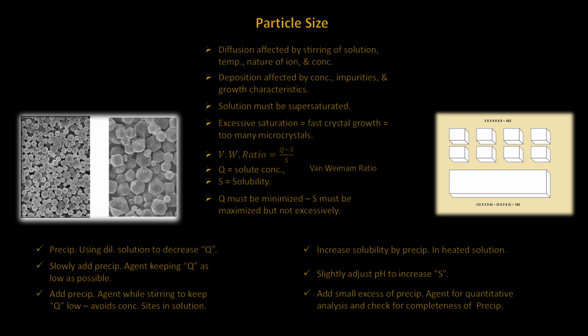If the procedure is carried out for quantitative analysis, a little excess of the precipitating agent is added, and a check for completeness is conducted. However, too much reagent may introduce contamination into the crystal.